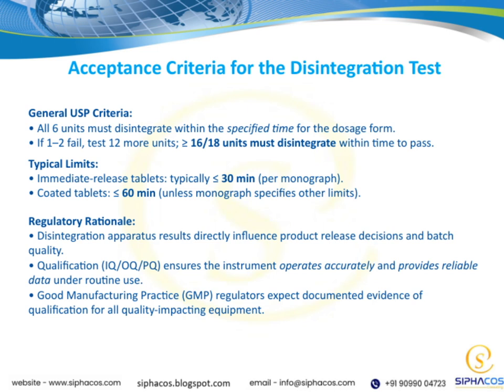When we talk about typical limits, for immediate-release tablets, the disintegration time is usually set at 30 minutes or less, as specified in the monograph. For coated tablets, the limit is generally 60 minutes, unless the monograph states otherwise. These limits are designed to ensure the product releases the active ingredient promptly.